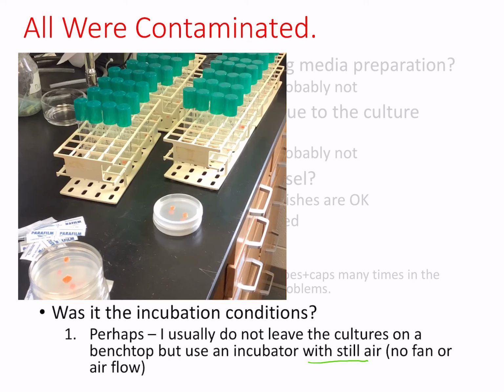So at the end, I don't know. I have no idea why all of them were contaminated. I can only come up with ideas and hypotheses. And if I was to do this again, I think what I would do is just not use the test tubes and just stick with Petri dishes.